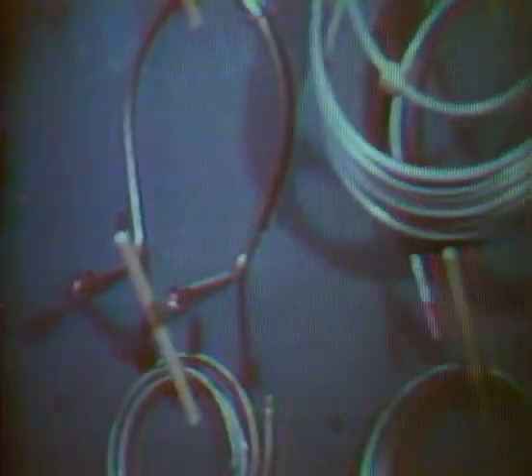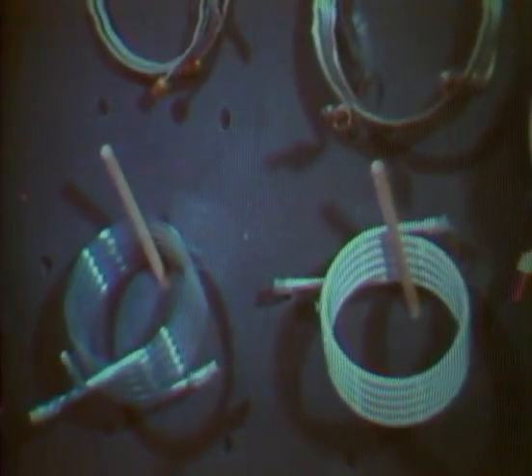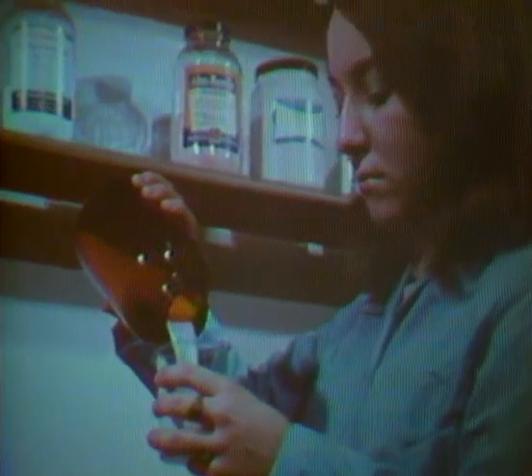Typically, packed columns are made of copper, stainless steel, aluminum, or glass, which is preferred for its inertness toward unstable samples. A packed column is filled tightly with solid, porous particles of uniform size.